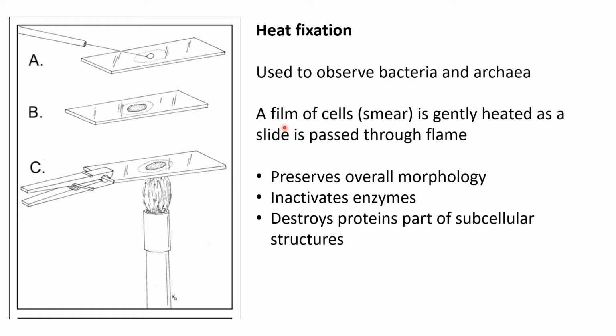So this method is used to observe the bacteria and archaea mainly, and in this a film of cells or smear is gently heated as the slide is passed through the flame. So it helps preserve the overall morphology, inactivates enzymes, and destroys proteins, part of subcellular structures.